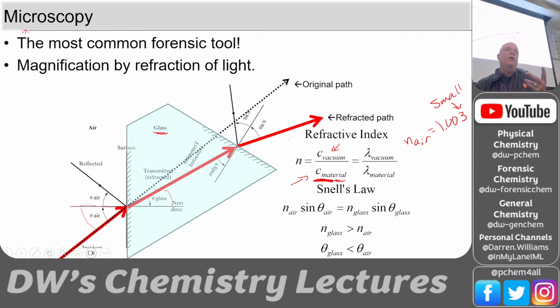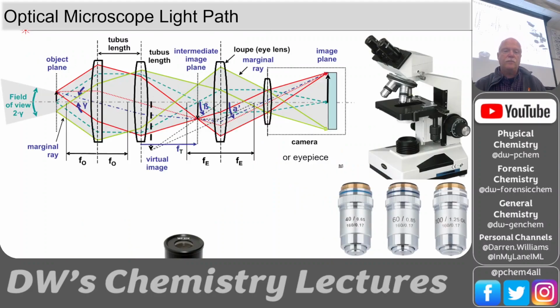But for really accurate work, you'll see lists of vacuum wavelengths. If you wanted to talk about the wavelength of a laser and be as accurate as possible, you would list its wavelength in a vacuum. Then you could correct that wavelength based on the material it's going through, so you could work out its apparent wavelength in air, or in glass, or in any other material like a diamond. We can use this refractive index to magnify light, to focus it, and so on.